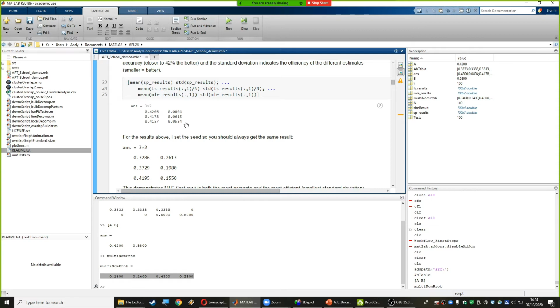That comes down in a root n manner, as in that equation that I showed you before for the counting error. So as you increase the number of counts, your counting error is going to get better with the square root of the number of counts. So if you increase it by 100, it's going to get better by a factor of 10.